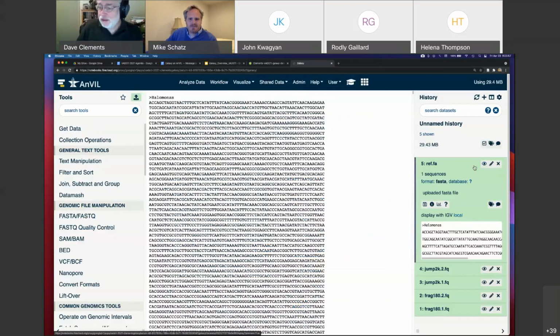Okay. Now, before we get started, there's a couple best practices I want to do in Galaxy. One is name my history. Galaxy is quite happy to have you have 15 histories called unnamed history, but it doesn't make you happy.